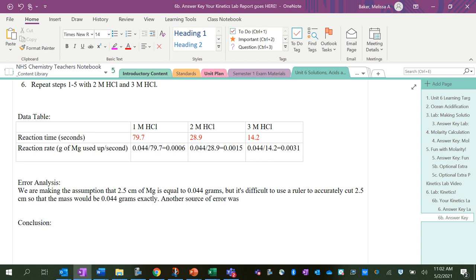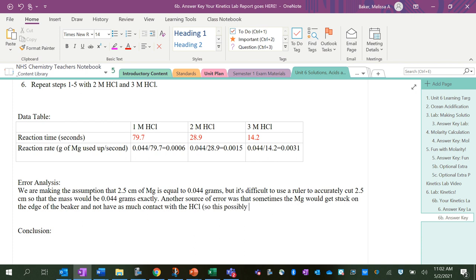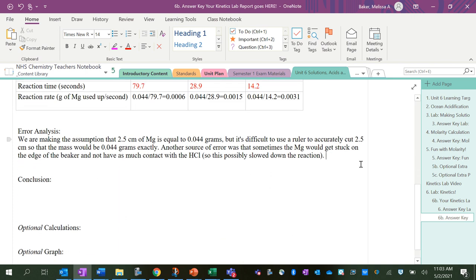Another source of error was that sometimes the magnesium would get stuck on the edge of the beaker and not have as much contact with the HCl, so this possibly slowed down the reaction. Like if we would have used a larger beaker, maybe that wouldn't have happened where it kind of got stuck on the edge.